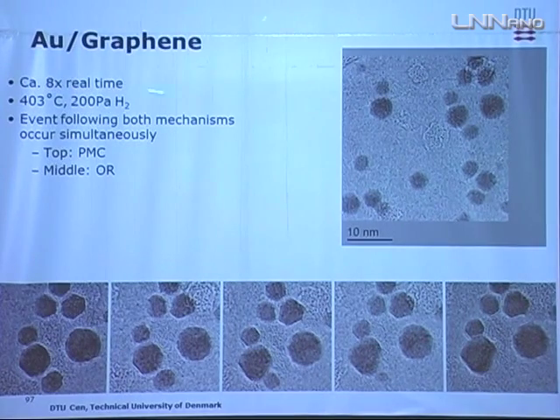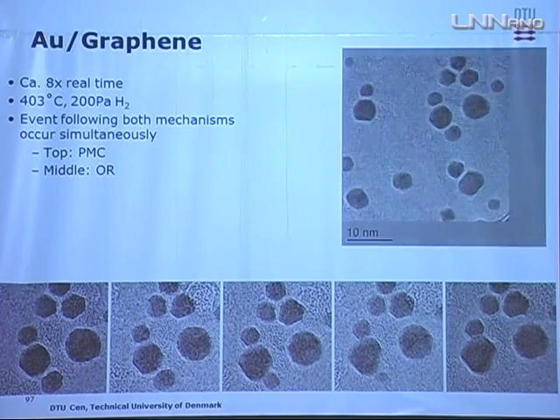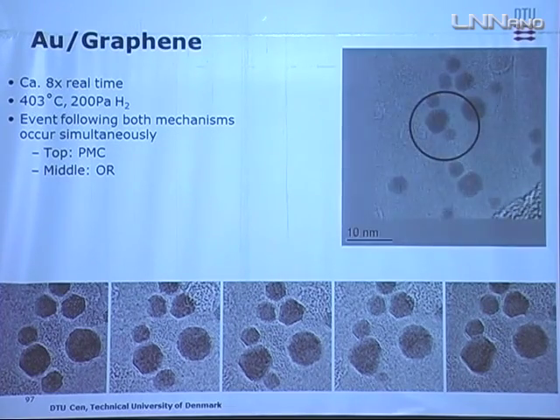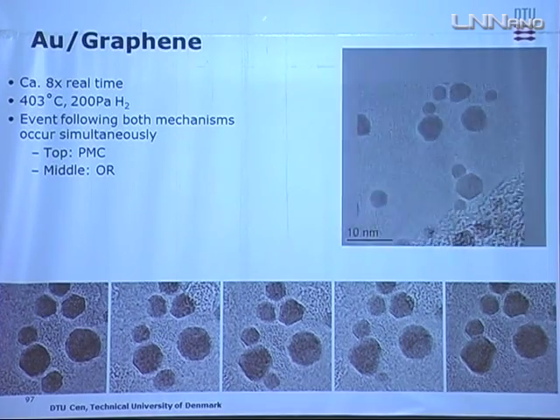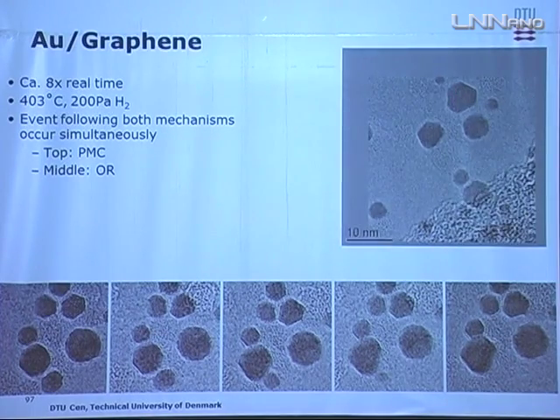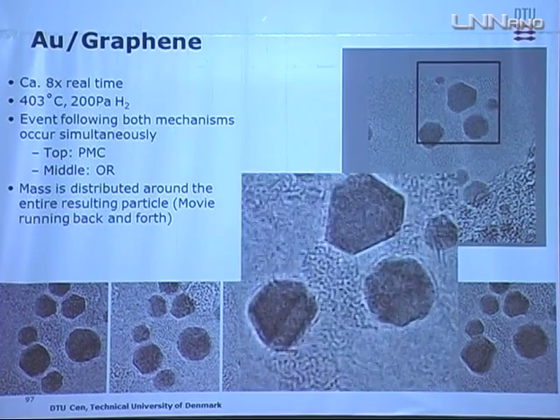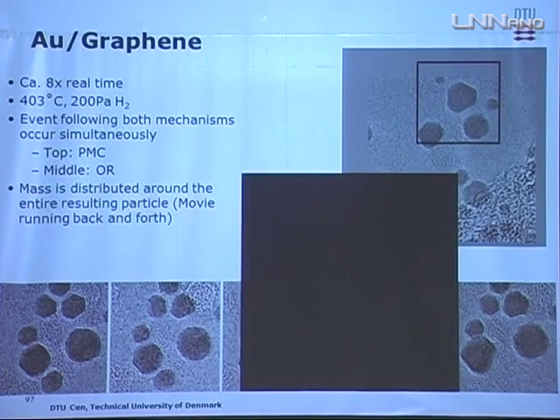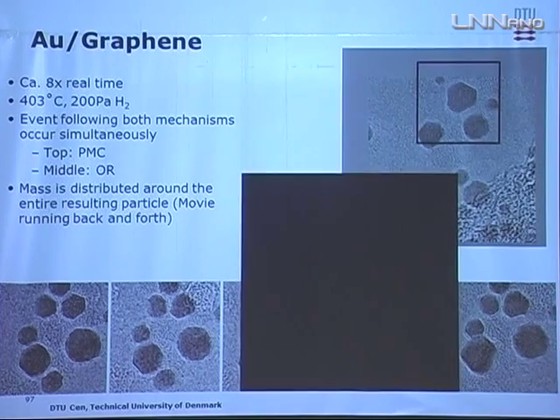Now, if you increase the temperature and put a bit of hydrogen in there, all of a sudden things look a lot different. I've outlined an area up here. You can see this little particle is gradually being sucked in by the larger particle. And as far as I remember, up here you see the particles are sucking up each other. I extracted a few frames down here, and I also made a zoom of this area. You can see this much clearer. This runs in loops, so it doesn't spit the particle back out again. It really just absorbs it.